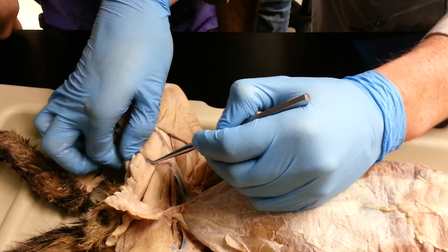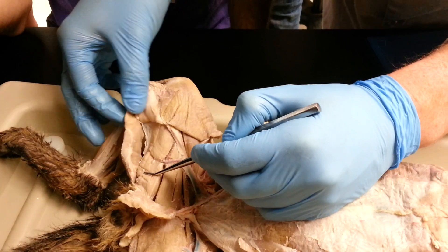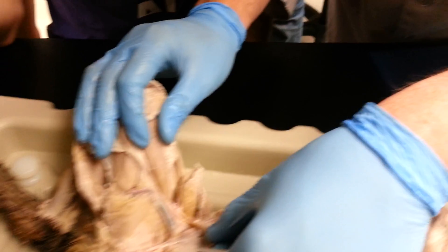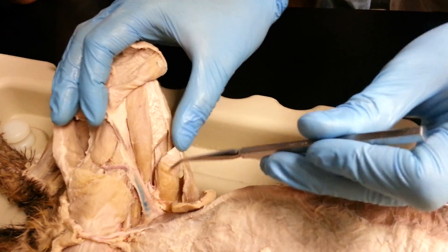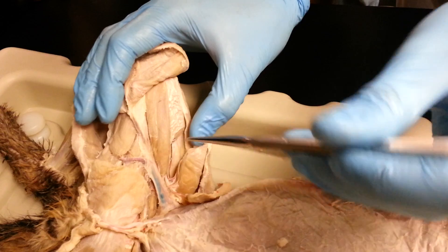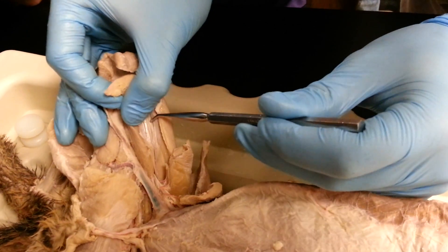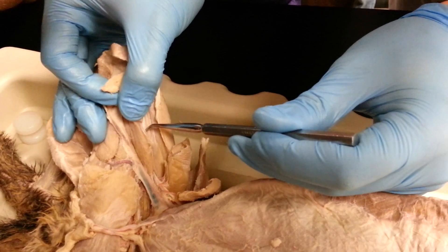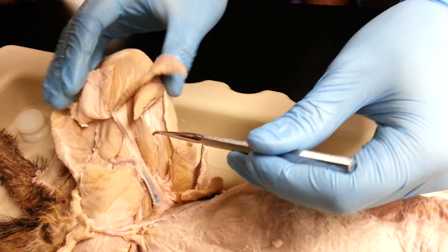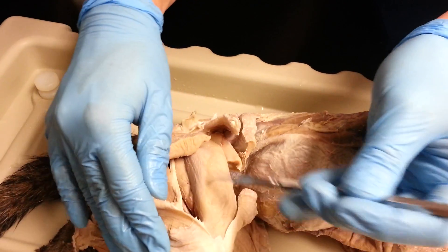Then this is the semimembranosus, and this one right here is the semitendinosus that I've sort of just ripped off right here. Then, underneath the sartorius, we have the vastus medialis right here, and then there's the rectus femoris right here. Underneath the rectus femoris, there's a tiny little muscle called the vastus intermedius. On the other side, we have the vastus lateralis. These are your quadriceps group.